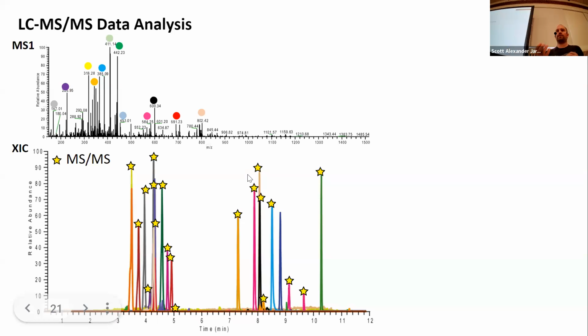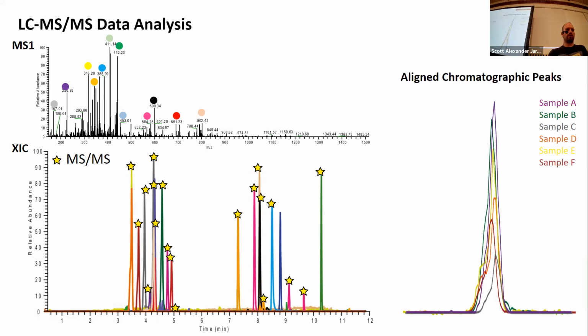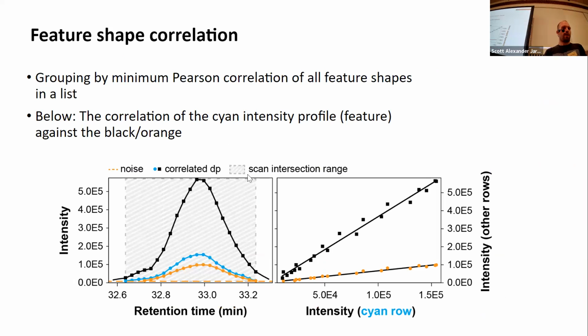So it really connects the semi-quantitative information from the MS1 level, from those survey scans from your DDA cycles, to the MS2 level. And this makes it, I think, much more accurate when you want to compare relative quantities between samples. Because with only the MS2 level, I mean, you could theoretically do that too. And as Scott pointed out, if you have a very simple question, that might be the tool of choice. But obviously using sophisticated tools such as MZmine or XCMS or other feature finding tools, you get better semi-quant information. All right.